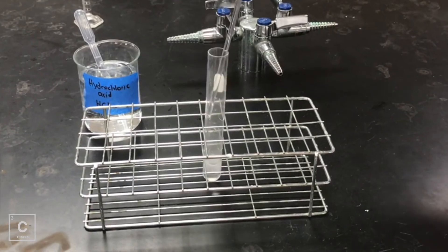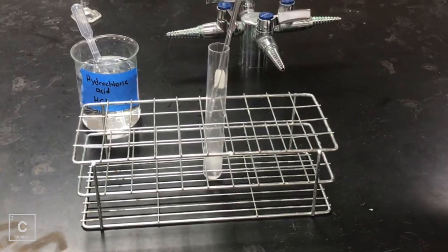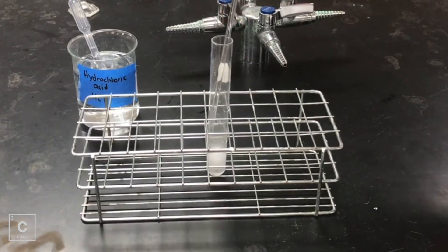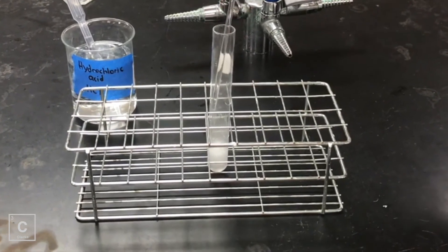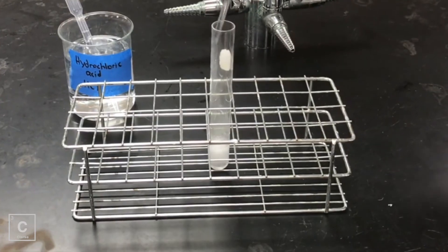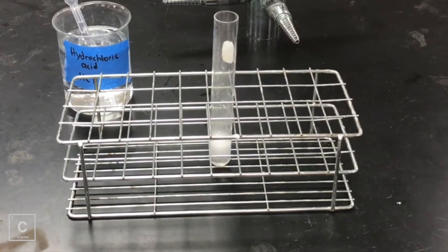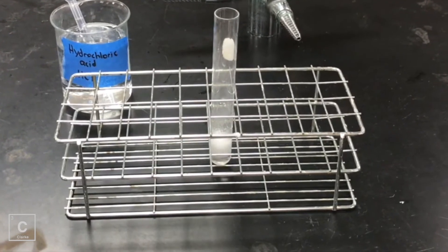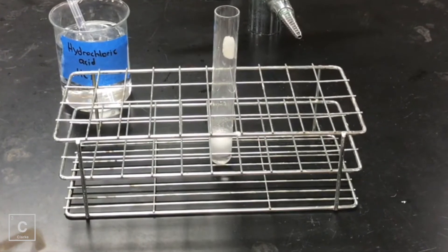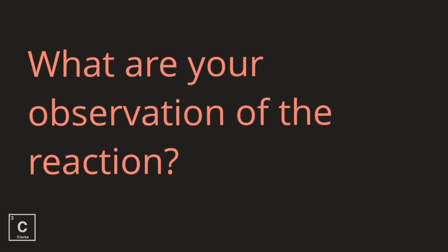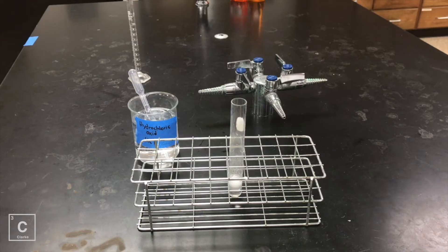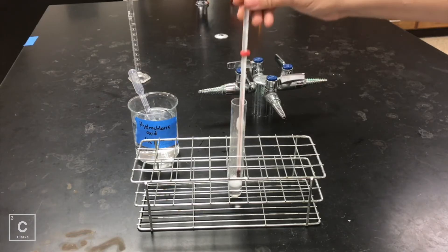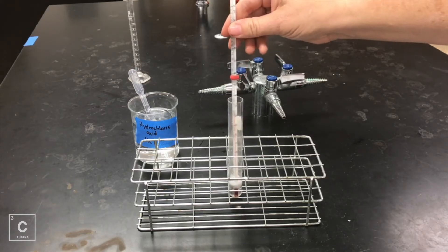Now I'm going to add the magnesium into the acid. I'm going to push the magnesium down a little bit more to make sure it all reacts. What are your observations of the reaction? Make sure and write these down.